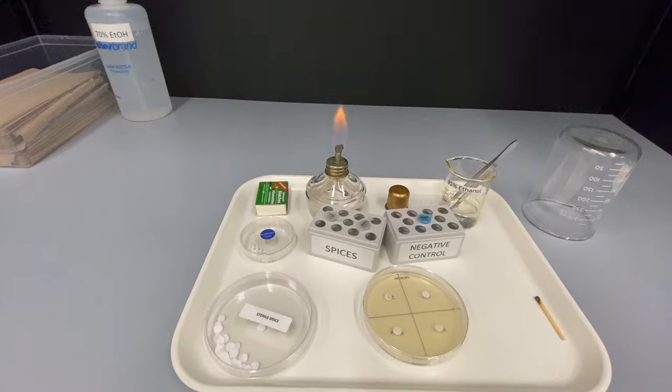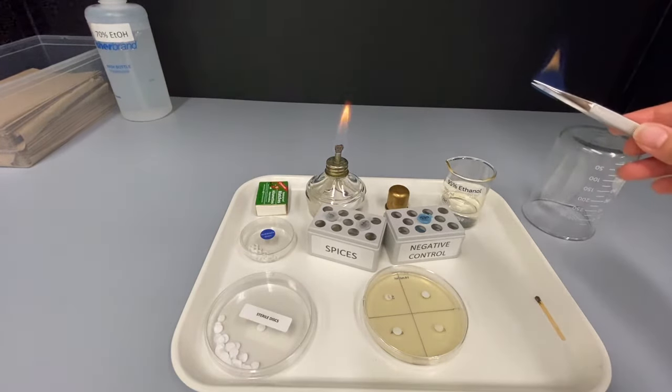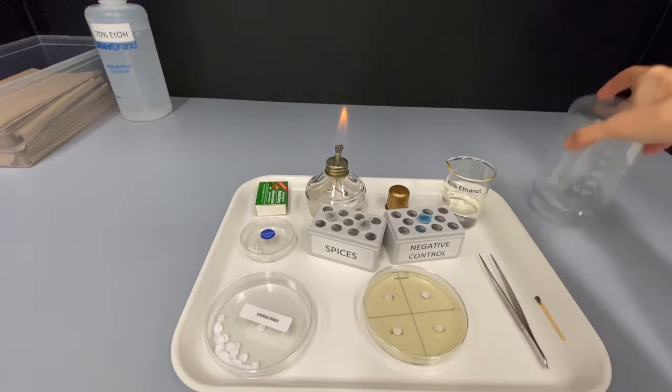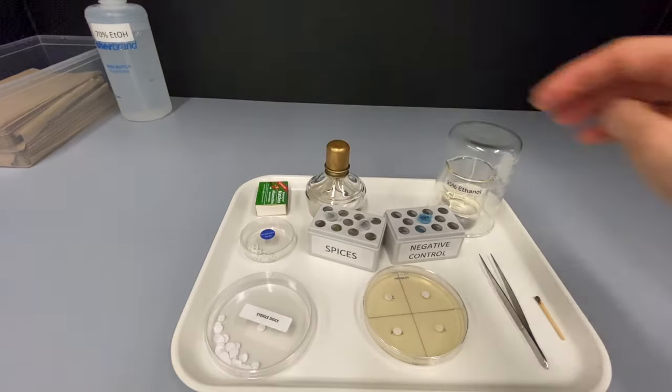Once all of the discs have been placed on the plates, dip the forceps into the 95% ethanol, pass it through the flame, wait for the ethanol to burn off and return the forceps to the tray. Cover the 95% ethanol and extinguish the flame by covering it with the cap.